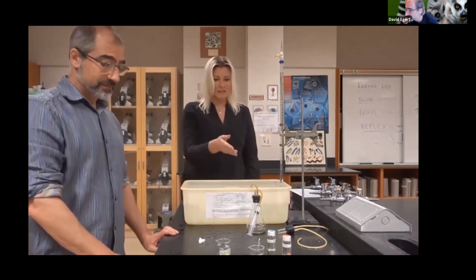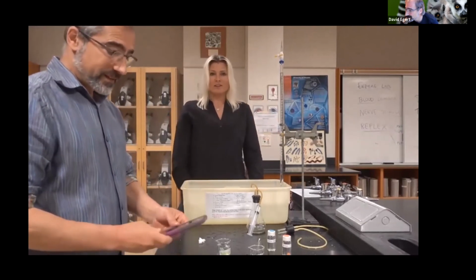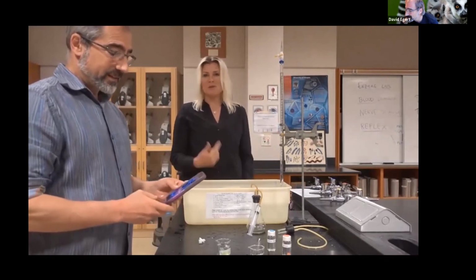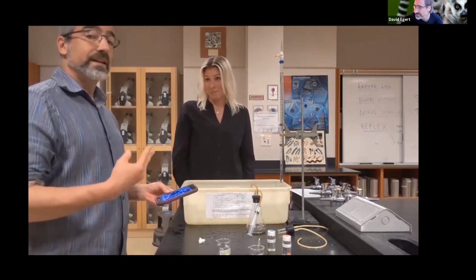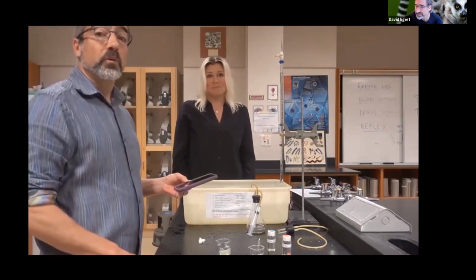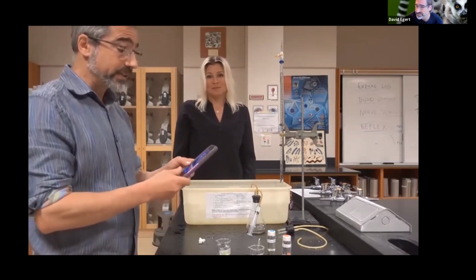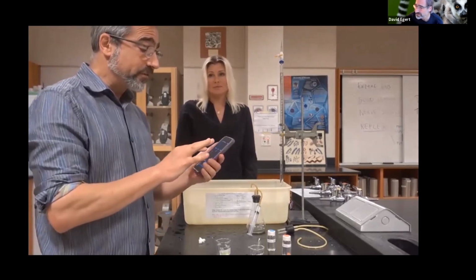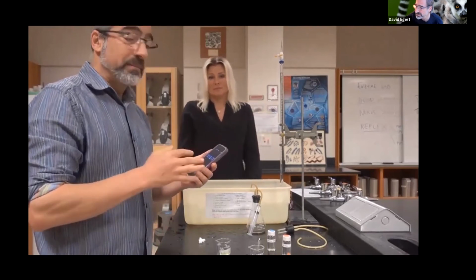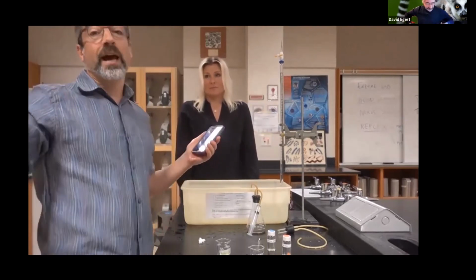So David is going to inject our hydrogen peroxide into our chamber, and I'm going to be reading the volume every 5 seconds. And again, we typically have 4 people working at this at the same time. There'll be the timer person who is going to do the time every 5 seconds. You could just say mark, time, now, whatever.